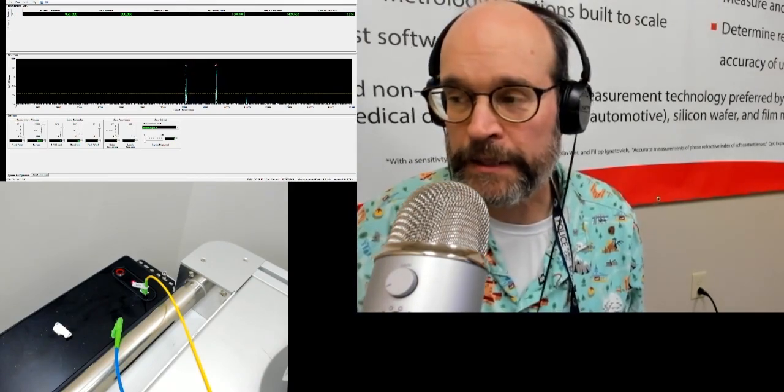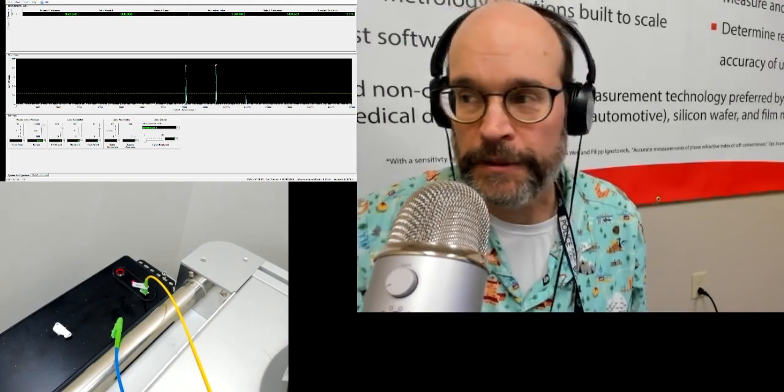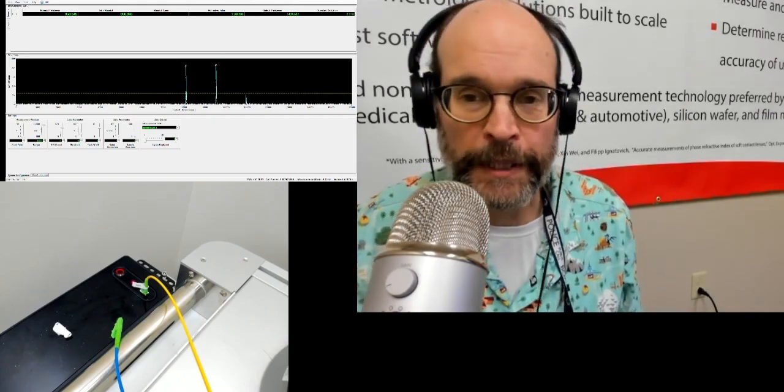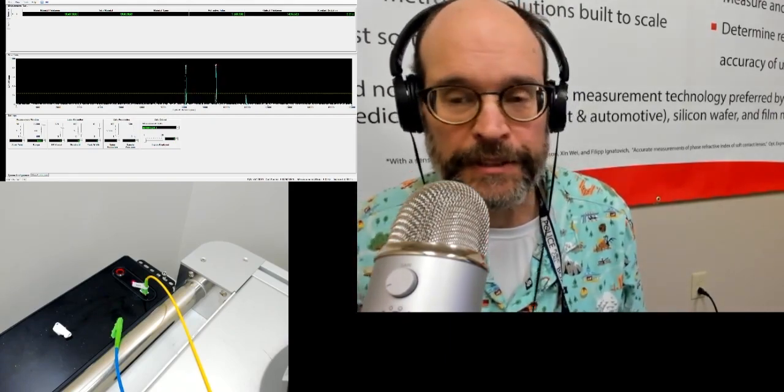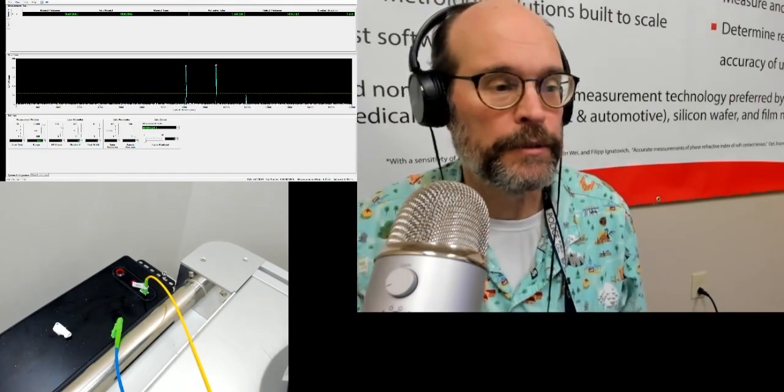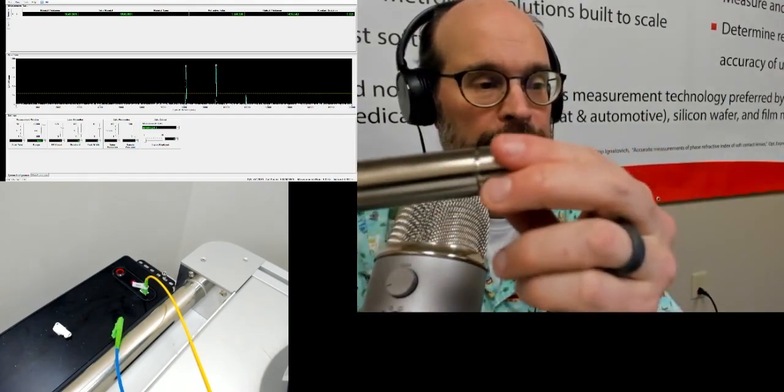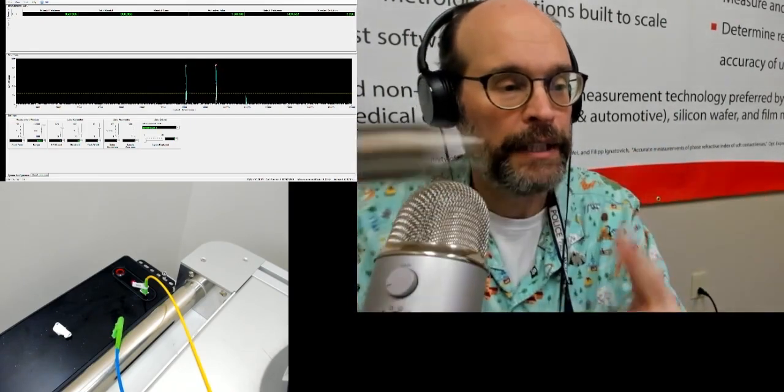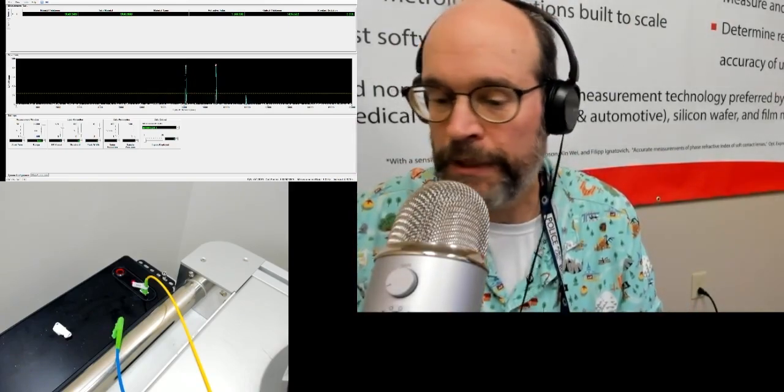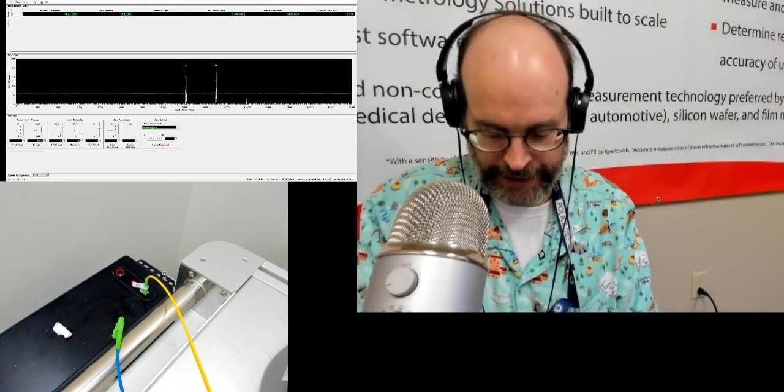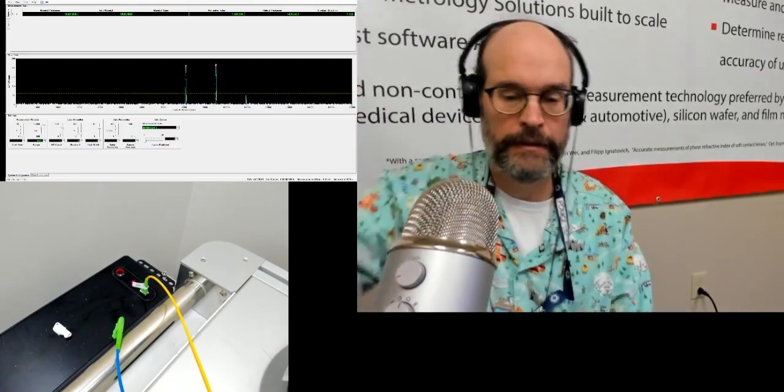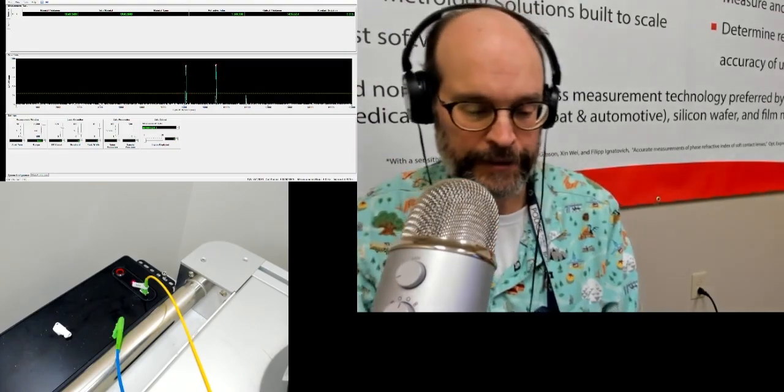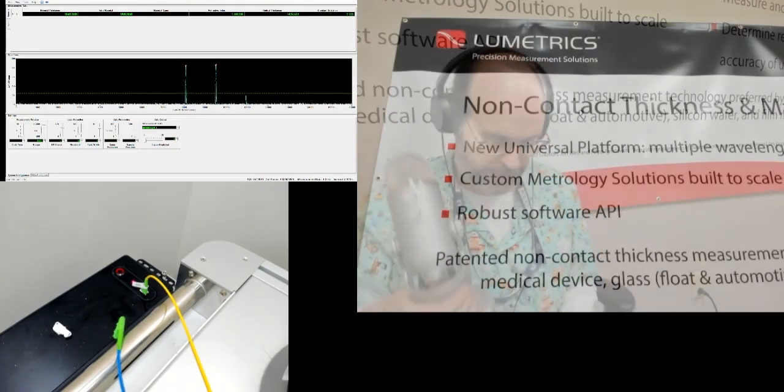So I'll basically be taking out the yellow fiber, which is running the probe right now, and I'll put in place the blue fiber, which is connected to the verification probe. And the verification probe will then tell us how well and accurately we're measuring our setup.